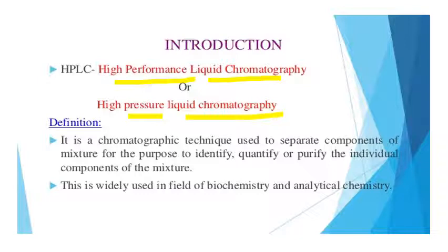It is the chromatography technique used to separate out the components of the mixture for the purpose to identify, quantify, or purify the individual components of the mixture. This is widely used in the field of biochemistry and analytical chemistry.